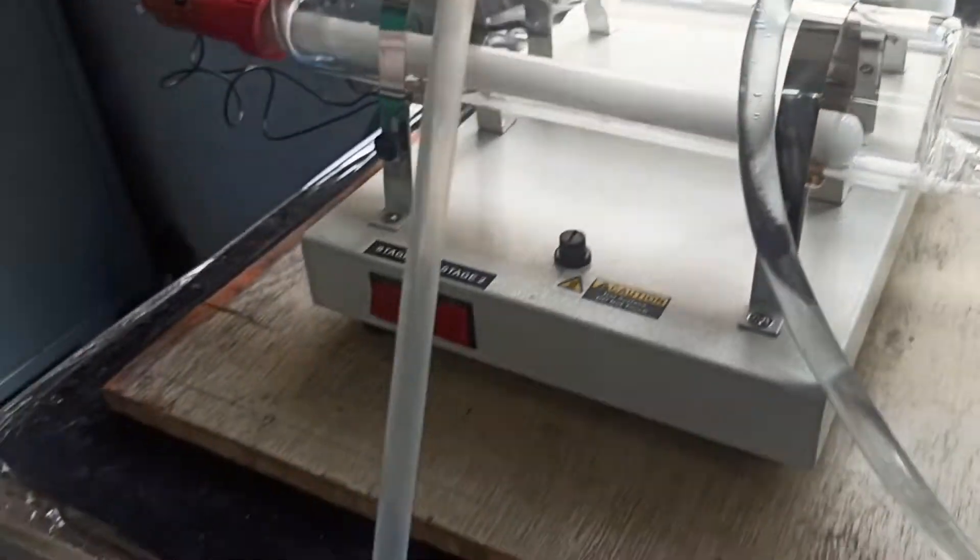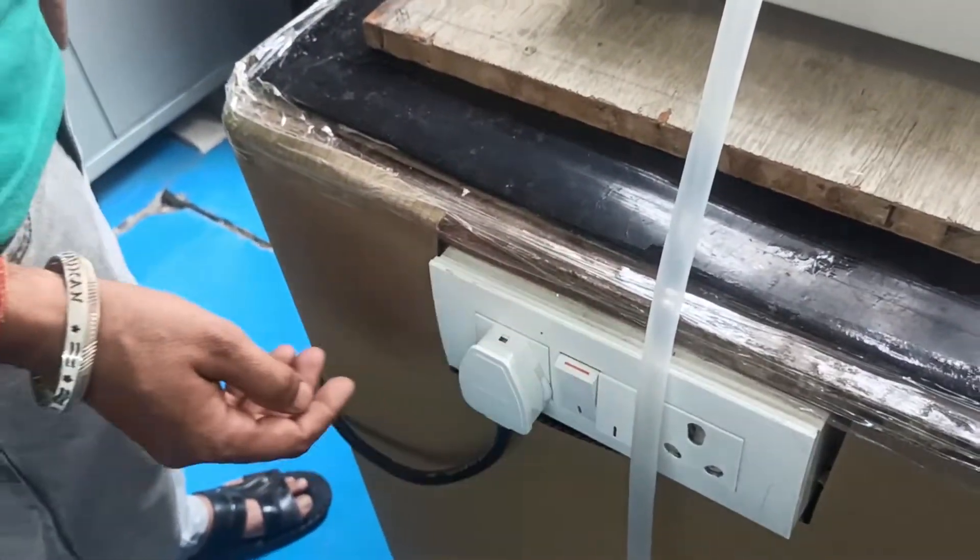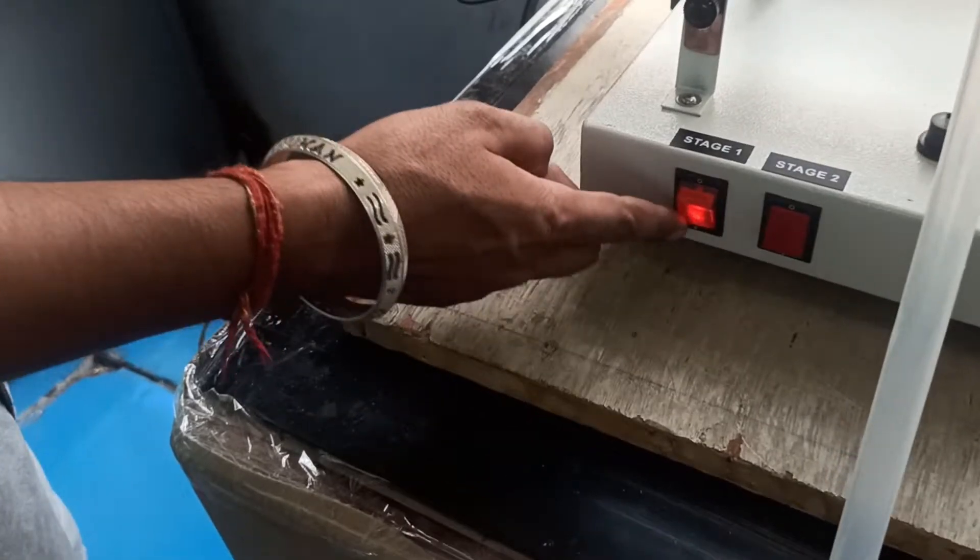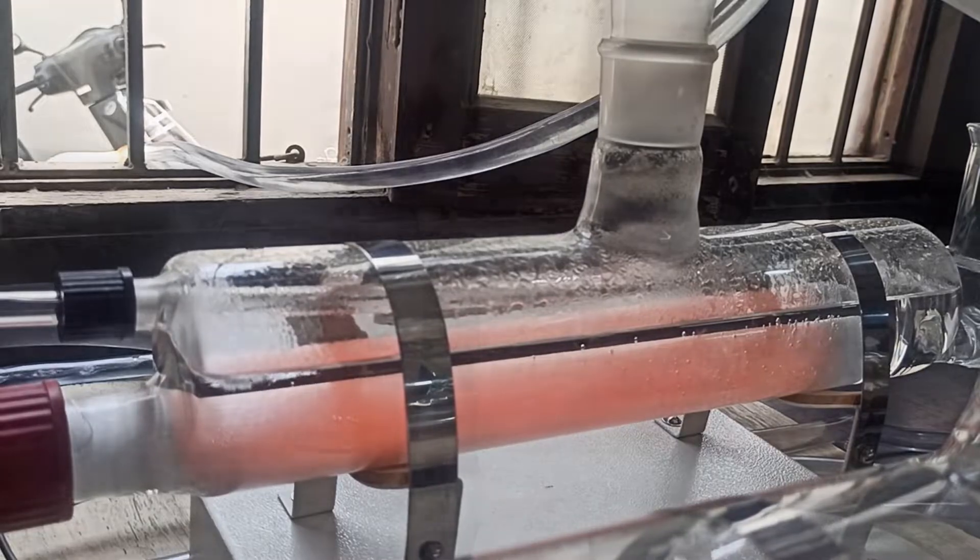Now, you can switch on the first stage power supply by pressing the stage 1 on-off switch. After some time, the distilled water output starts coming from the first stage.